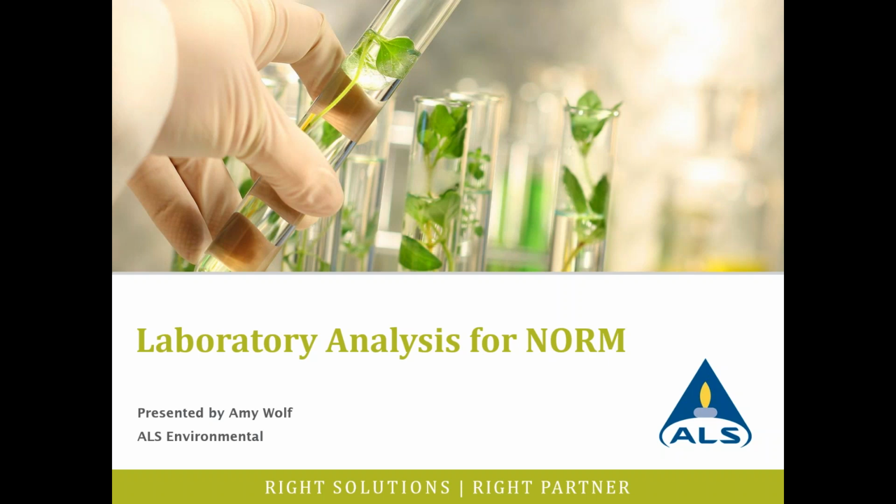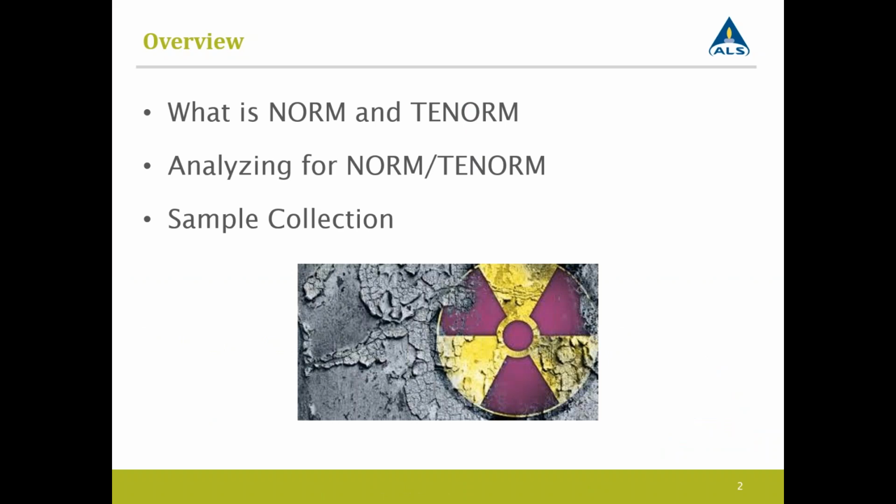Thanks, Tim. Hello, everyone. Today I'm giving a short presentation on norm analysis, and we'll have plenty of time to answer questions at the end. So laboratory analysis for norm, we're going to talk about what is norm and TENORM, analyzing for norm and TENORM, and then a little bit on sample collections, which will involve sample volumes.